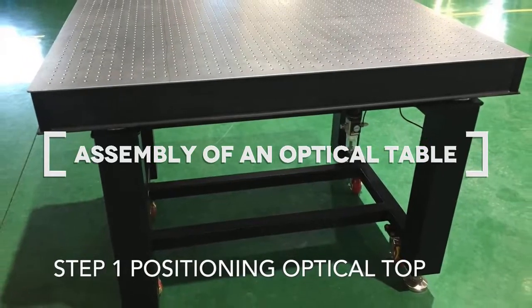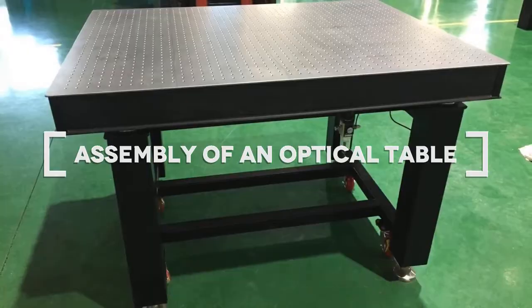In this video we will show you how you can easily assemble an optical table after shipping.